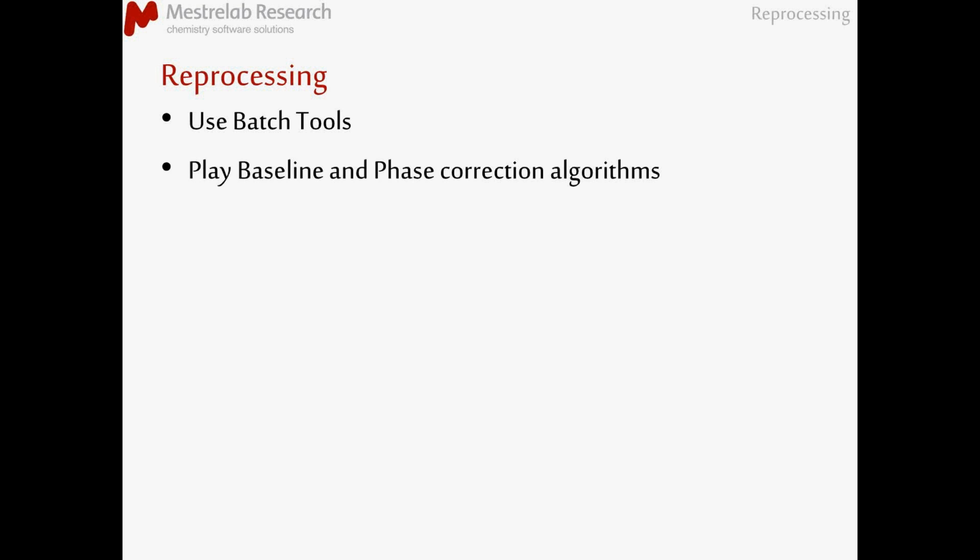There are ways, which we will go over briefly later on, that you can bring in hundreds or thousands of spectra and just check that your reprocessing conditions are optimal for each of your samples. This is absolutely critical. Most of us tend to mostly ignore the first one and pay a little more attention to the second one, but both are really critical if we want good quantitation. And at the end of the day, that is the game that we are playing.